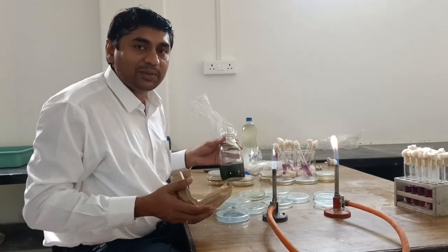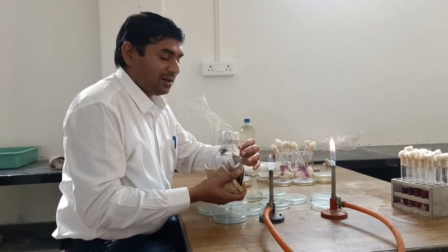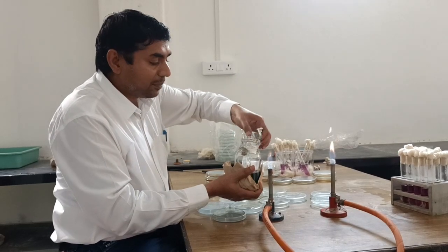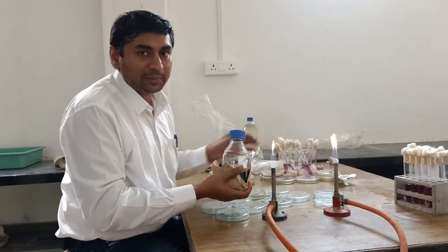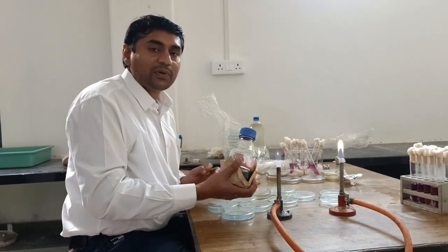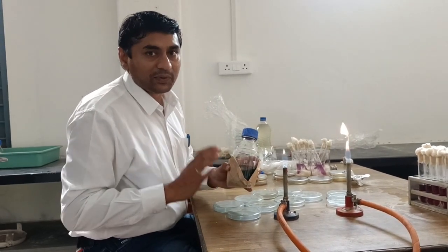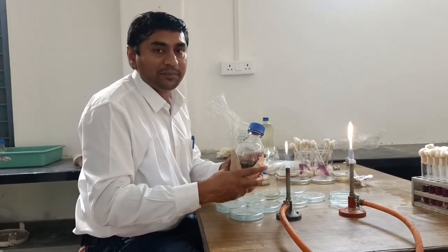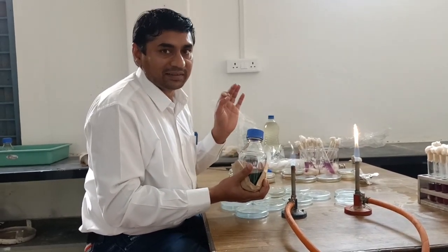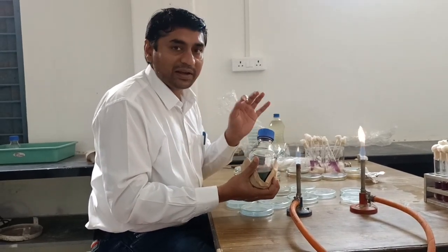In this video we are going to discuss the skills for transfer of nutrient medium from bottle to petri plates. This operation should be performed aseptically in front of flame. Before transferring, we should disinfect our hands, otherwise the organisms present on our hands may contaminate the medium.